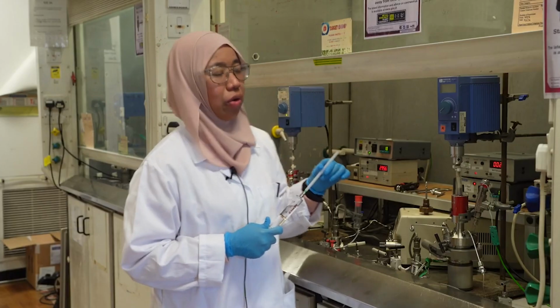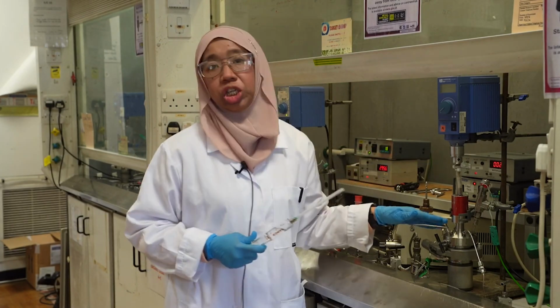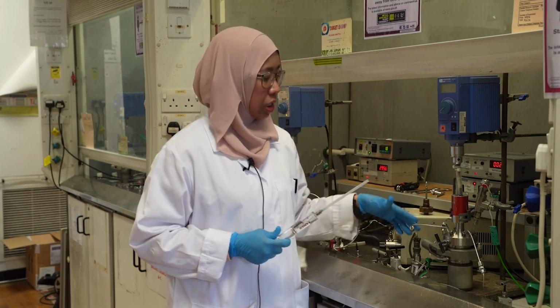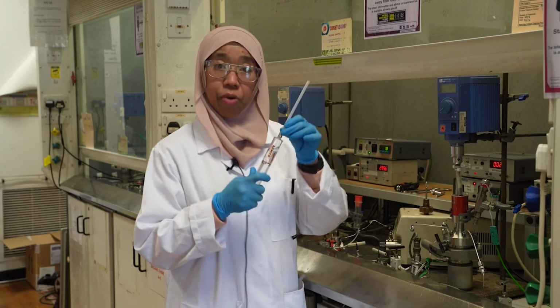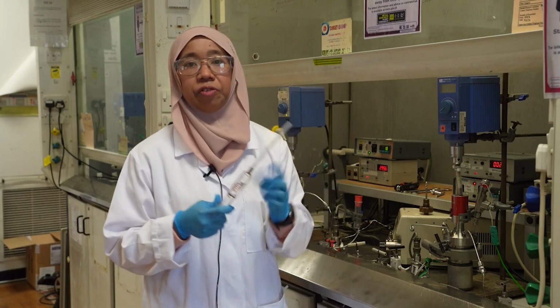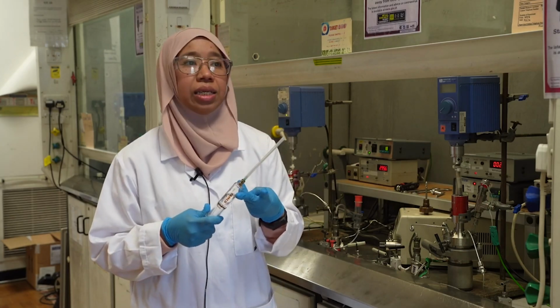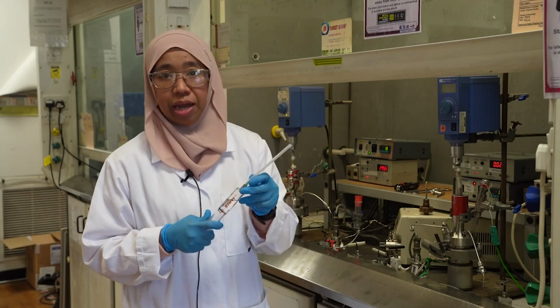So now we are going to start the reaction. So first of all, you have to condition the autoclave under positive pressure. So now it's ready. And I've already prepared the reactants that we need. It consists of three things: the monomer, the MMA, and the surfactant, PDMS, and the initiator, the AIBN.